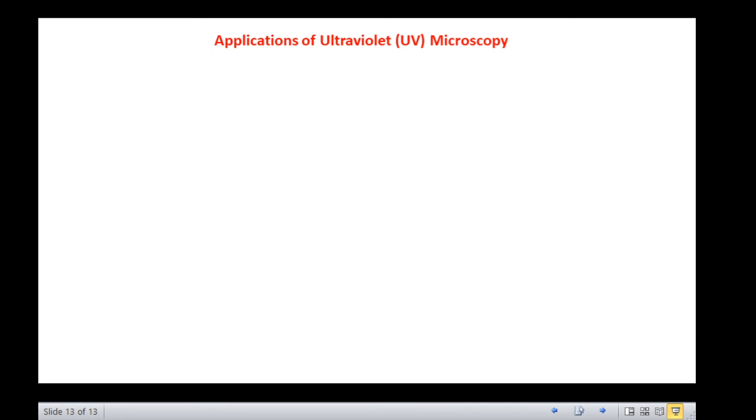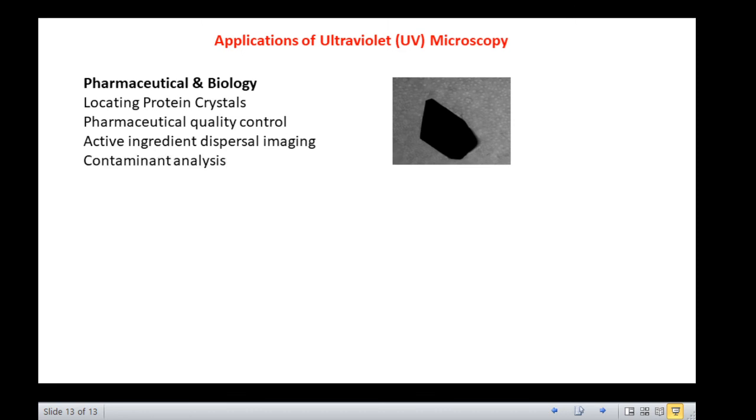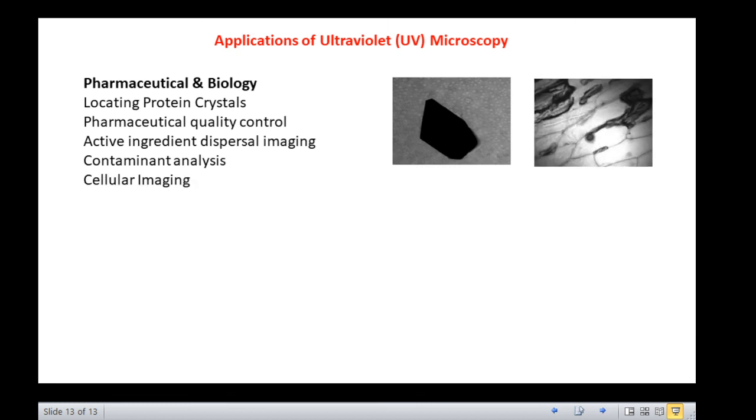The applications in the field of pharmaceutical and biological sciences are locating protein crystals, pharmaceutical quality control, active ingredient dispersal imaging, contaminant analysis, and cellular imaging.